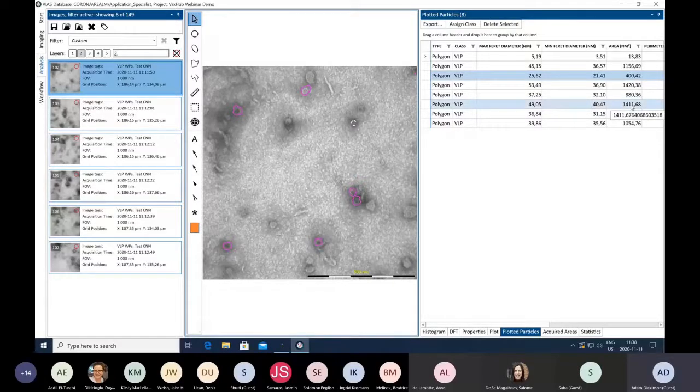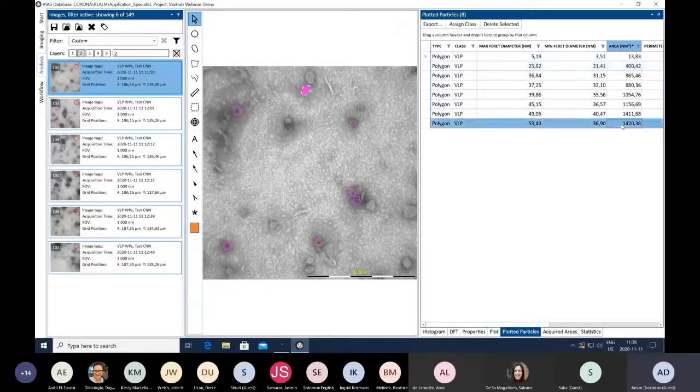We'll filter these by size. So click on the largest object. That looks around the right size, I'd say. And we were interested in the area, actually, what was the diameter of these particles? As you can see, it's quite close to the 40 nanometer range, which is what we were actually aiming for, which is great. So I'm going to apply a filter for size.